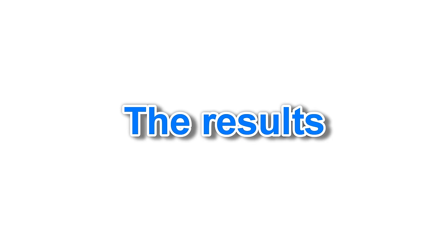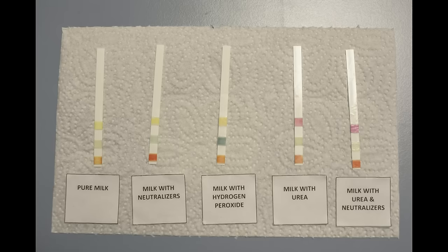What is the result? Milk security tests help only pure milk to be used in the dairy industry.